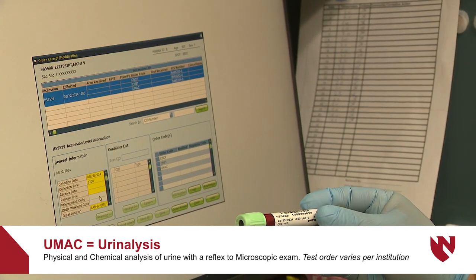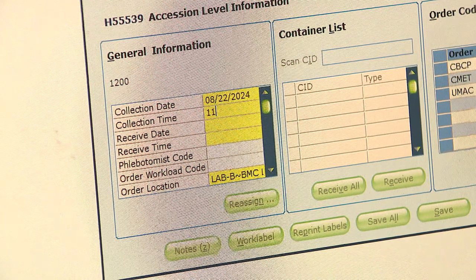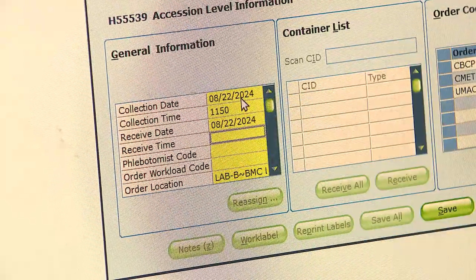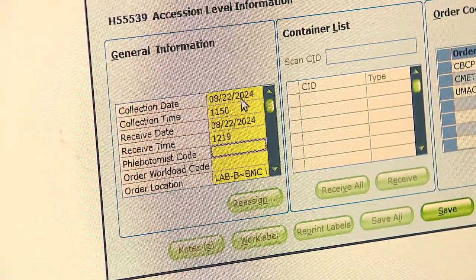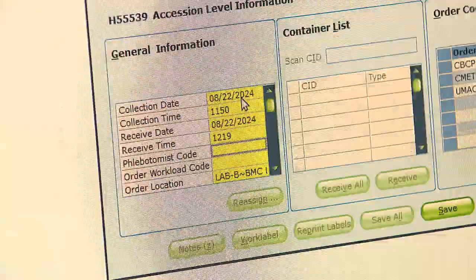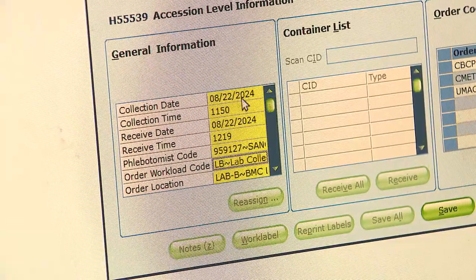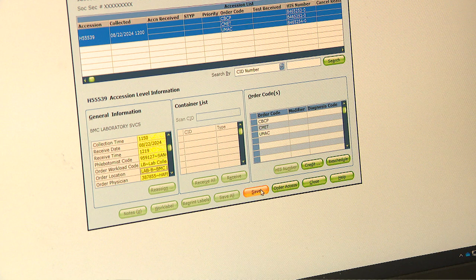So now we're going to log it in using the collection time and date. We're typing in the collection time as it appears on these tubes — this was collected at 1150. The collection date is today, the receive date is today, and the receive time is 1219. Whoever collected the tubes will write down their collector initials. In this instance, since I'm the one that collected these, I'll put in my collector codes. There are different work orders — it could be lab, a phlebotomist, or a nurse. Once we verify that everything is matched up to the labels, we can hit save.